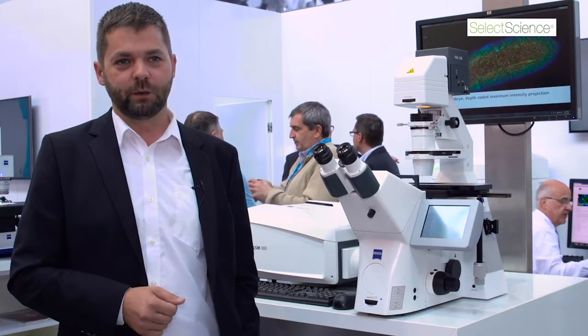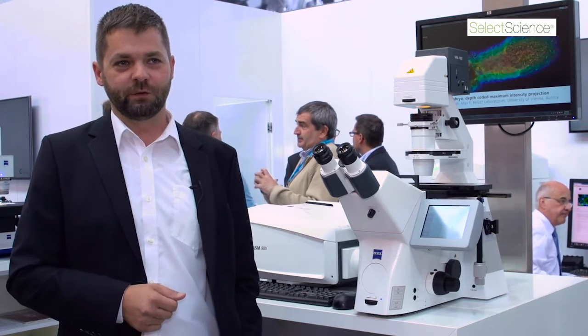We have a very good paper with Benjamin Prosser from the United States recently, where he imaged the twitching of a cardiomyocyte — an event that takes only a few milliseconds — and you can now image it with a confocal microscope.